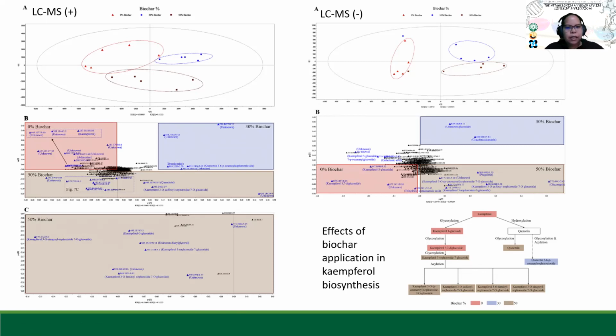In this particular project, we were able to see the complementarity of making use of LCMS and NMR for metabolomic study. You see more of the primary metabolism changes on the NMR side, whereas you see more of the secondary metabolite changes in the LCMS analysis part. So again, this is one application.